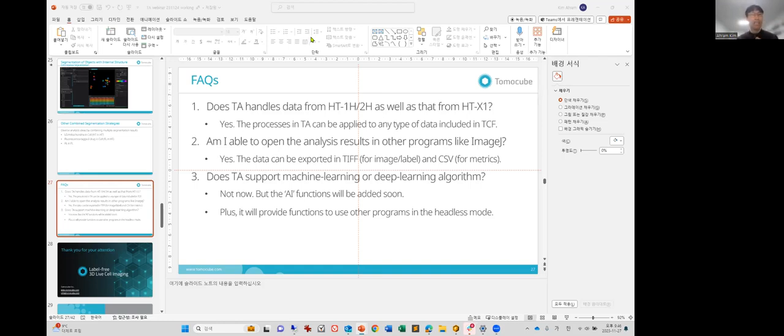And the other way is using a bit more advanced process, which is called watershed. Based on the shape of the segmentation result, we can calculate the inside of the perimeter, and based on that, we can make a better segmentation mask for that vacuole. So I think we can try multiple ways to get that segmentation.